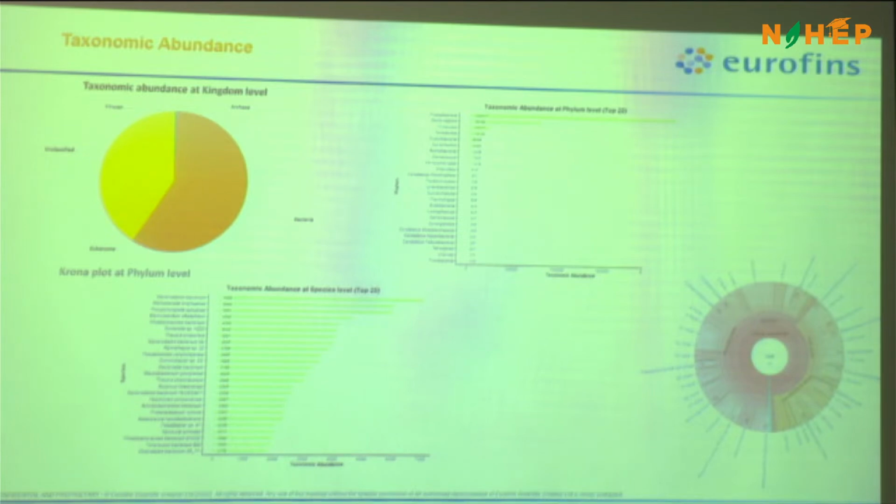So the result we get after doing all this analysis is your taxonomic abundance, where you can get your percentages of abundance. You can make a pie chart, you can make any other plot. When we are talking about metagenomics, we have taxonomic abundance across the organisms, like whether it is fungus, or the overall taxonomic abundance of various different phyla. And then we talk about bacteria specifically in whole metagenomics, then fungus, then viruses, based on your objectives again.